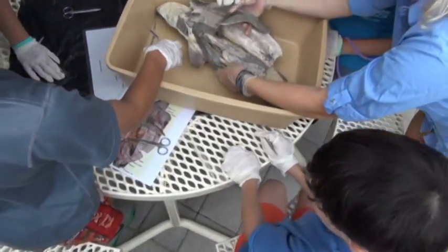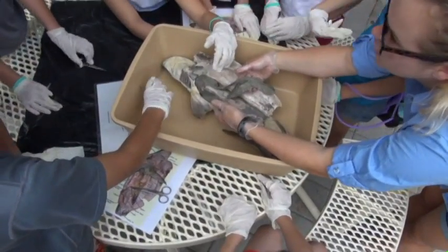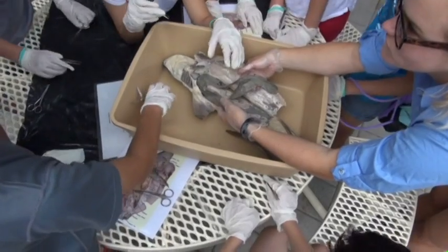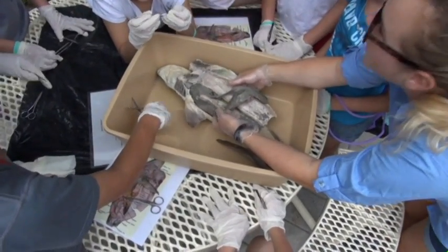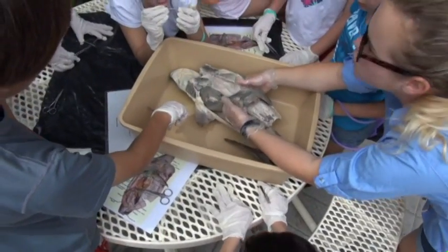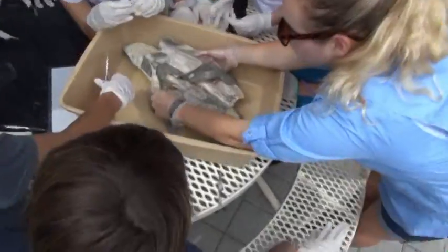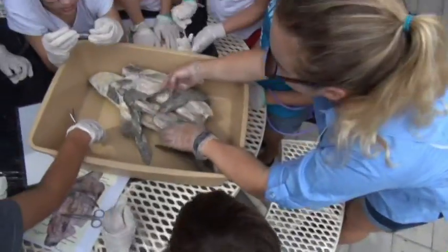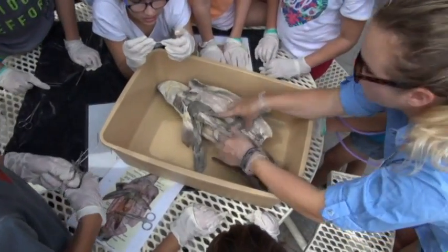This is a huge part of why a shark is an apex predator. Anyone know what that word means, apex? What does it mean? Awesome. Literally means best of the best, top, right? Apex, like if you're an apex predator, top of the food chain for your area. So being an apex predator, being an awesome animal that's very well evolved to survive in the ocean, this liver is a huge part of that. All of these fatty oils really help it to be buoyant.